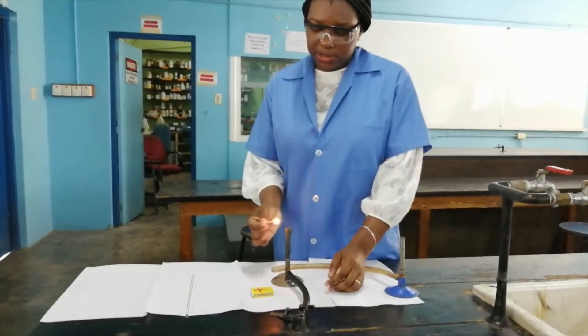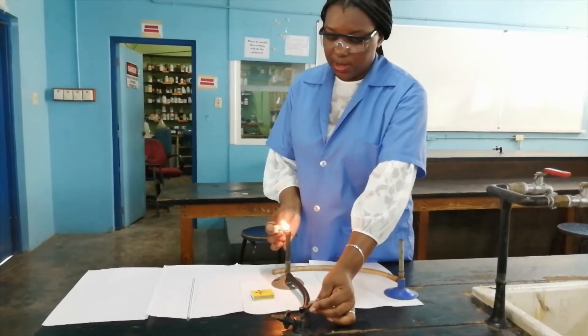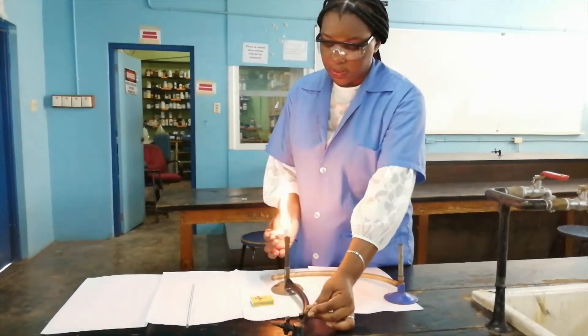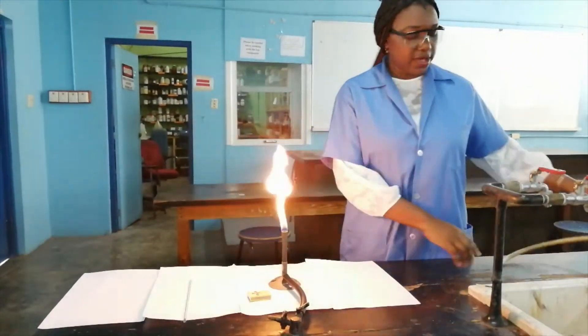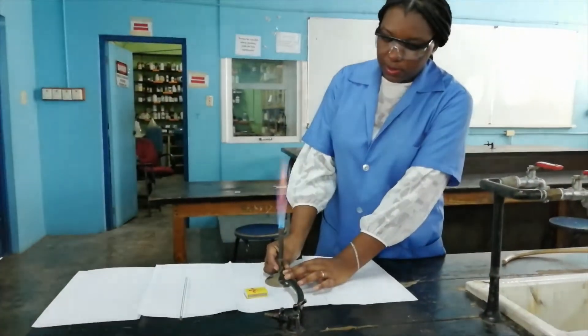When you strike the match, hold it to the side and gently turn on the gas. Move other equipment out of the way — that is a danger.